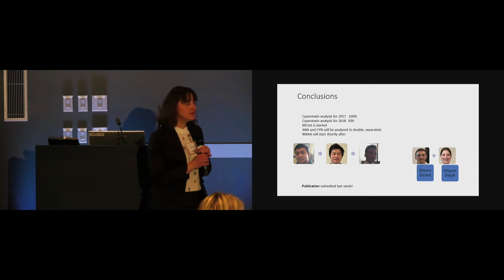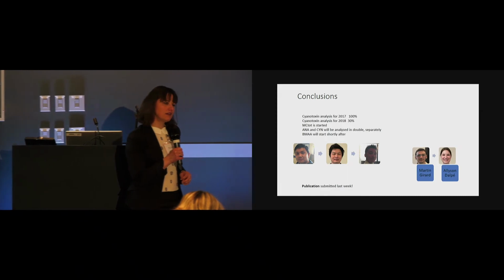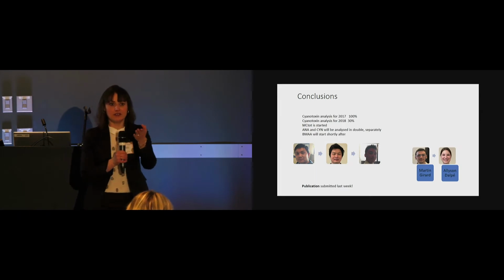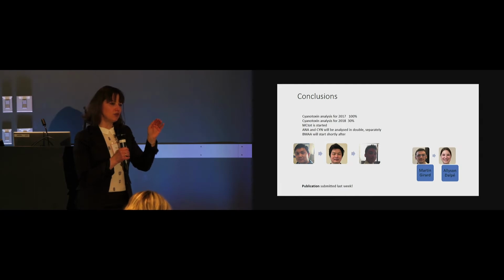But I think it could be comparable if we use proper statistical analysis, like I think it's the Kaplan-Meier analysis, which again was thanks to Barry for making me aware of it. It is used in pharmaceutical companies where they have a lot of data which is undetected or borderline.